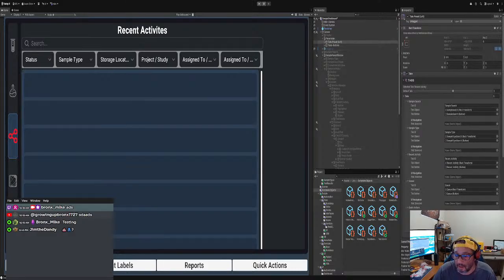Okay. Let me make sure we have. All right, and so we got the rule. I don't like this.